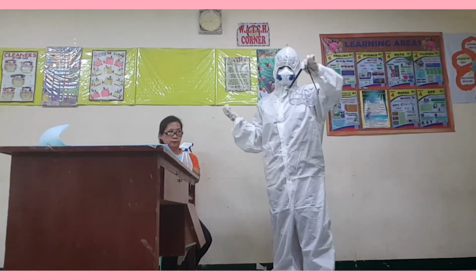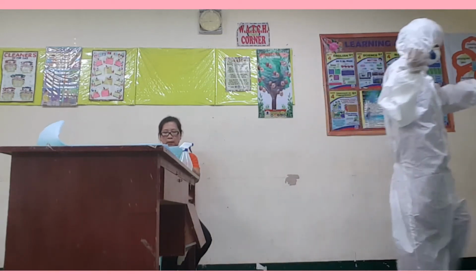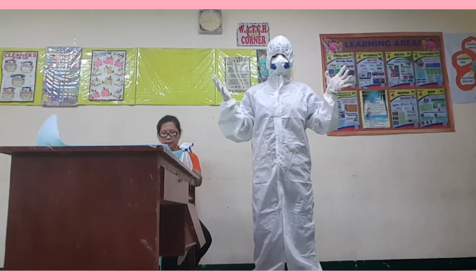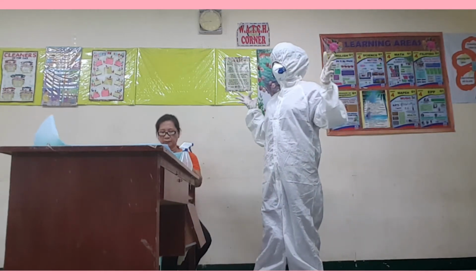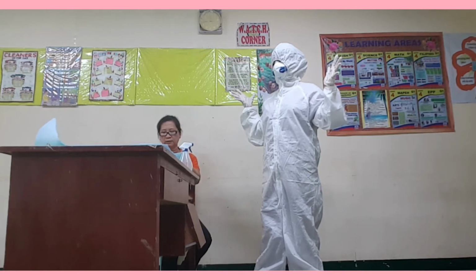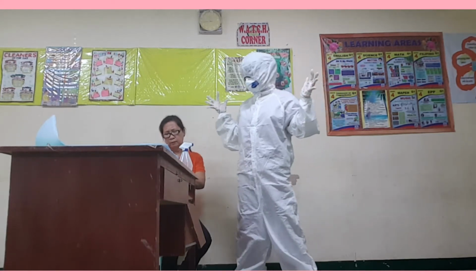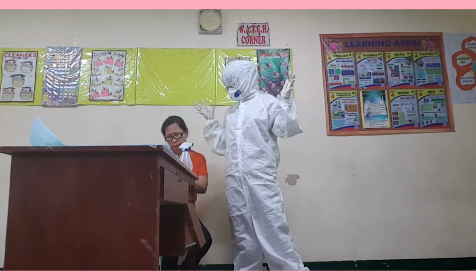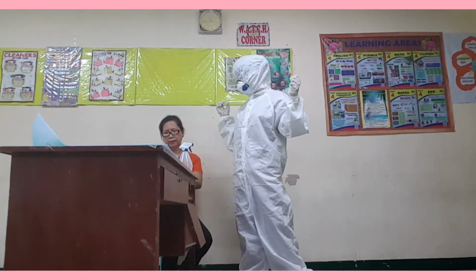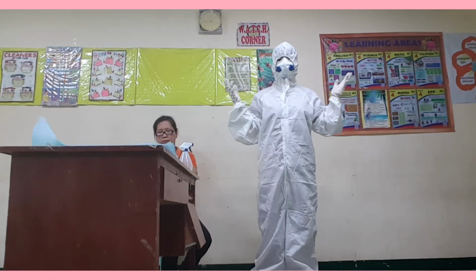Discard the goggles. Handling the strap as described allows removal without contaminating hands, touching only the elastic or mask strings. Protect and glove hands from contamination.